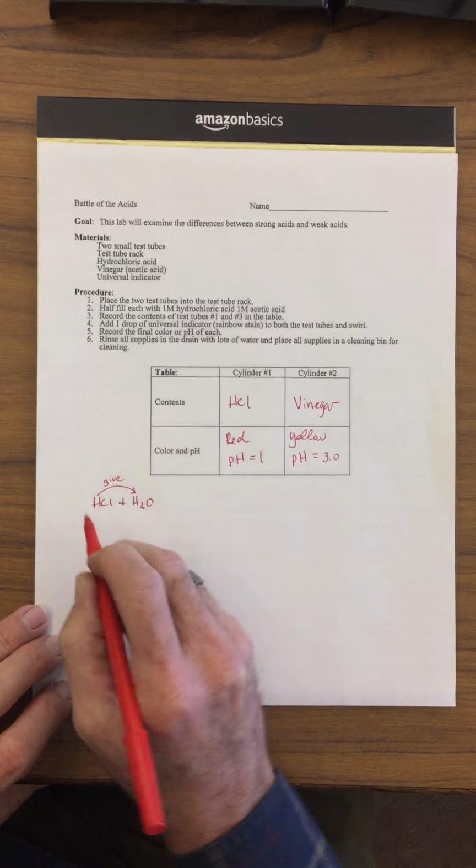So let's take a look at the second reaction, and the second reaction is the vinegar. So here's the HCl, and here is going to be the vinegar. The chemical formula for vinegar you will not need to memorize, but this is what it looks like: CH3COOH. So here, the H from the HCl gets given to the water.